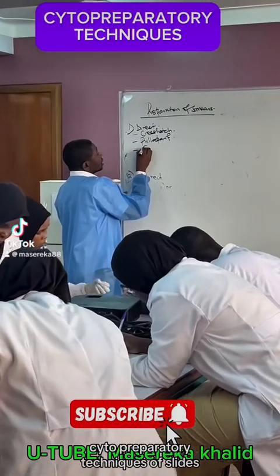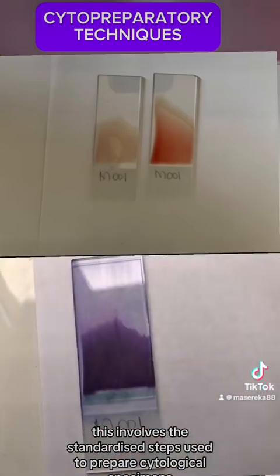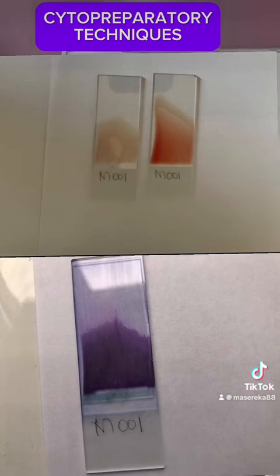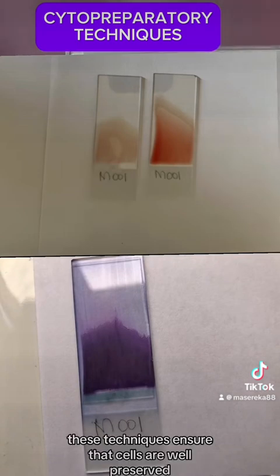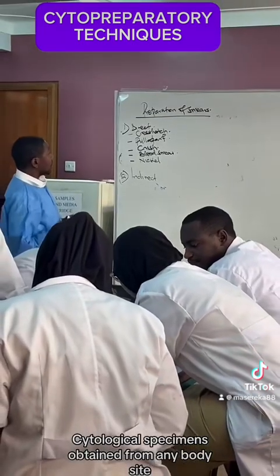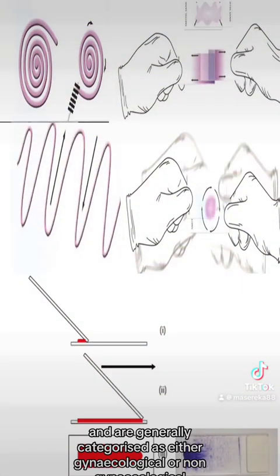Cytopreparatory techniques of slides. This involves the standardized steps used to prepare cytological specimens on glass slides for microscopic examination. These techniques ensure that cells are well preserved, adequately spread, and stained for accurate interpretation.